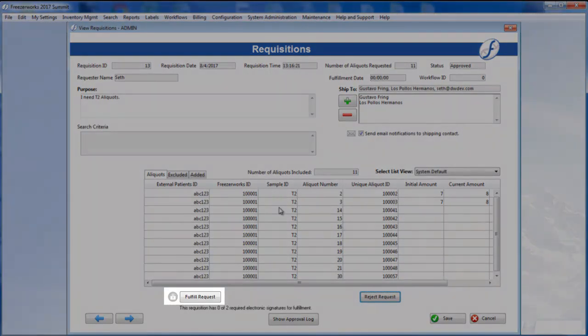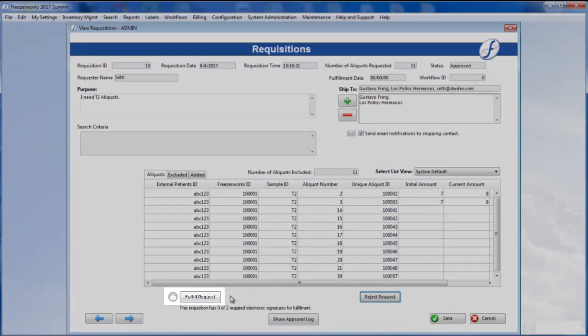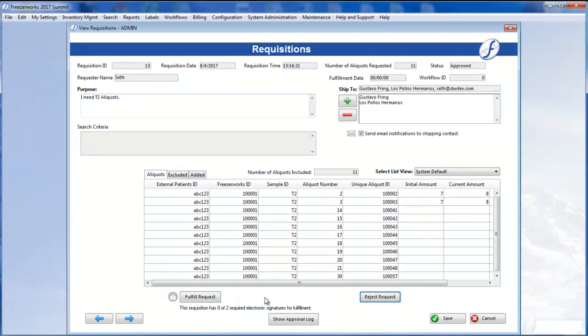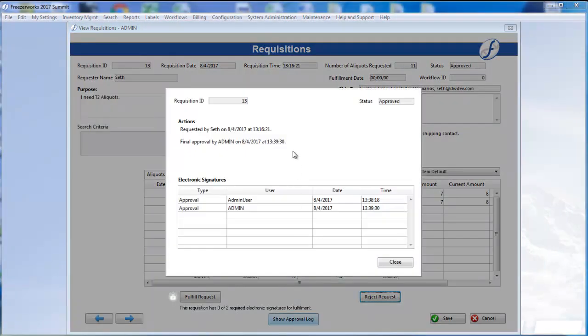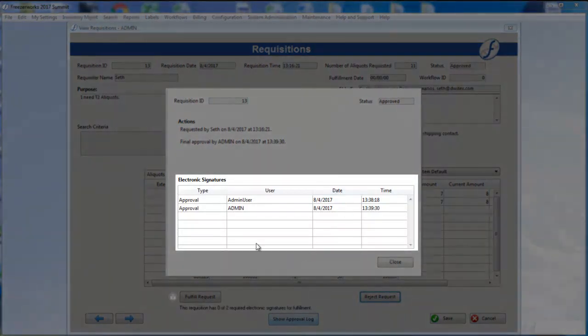The Approve Request changes to Fulfill like before. Let's take a quick look at the approval log. This succinctly depicts what actions have taken place on the requisition, and who has provided e-signatures. The two e-signatures we entered are visible in the list box.